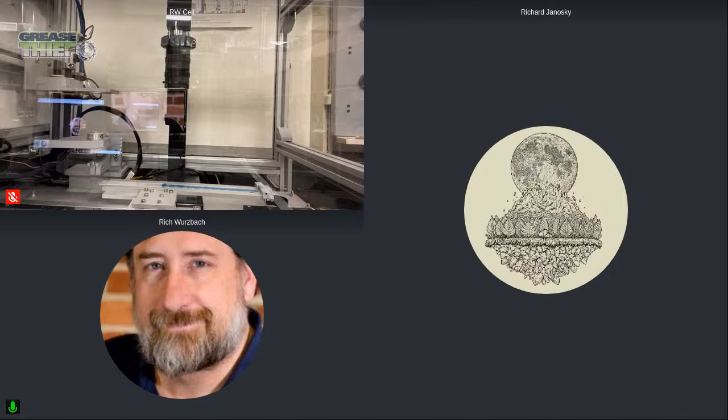Yes. So the first thing that we need to do is turn on the LED. So in the software, we'll just go to the LED controller, and then I will enable the LED and send that over, and then we will now see that start to strobe. You guys see that strobing?